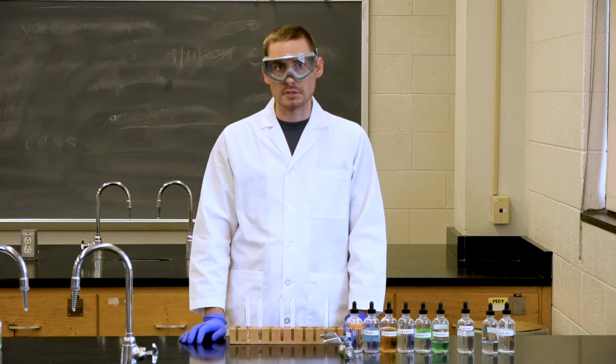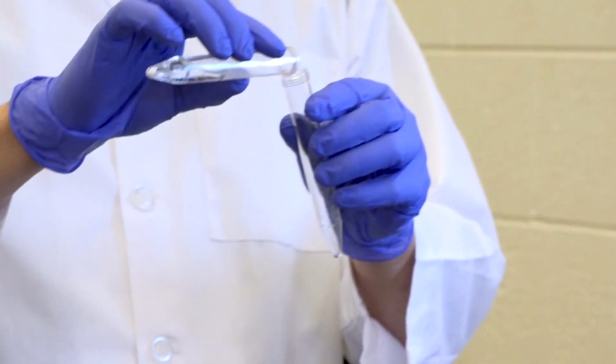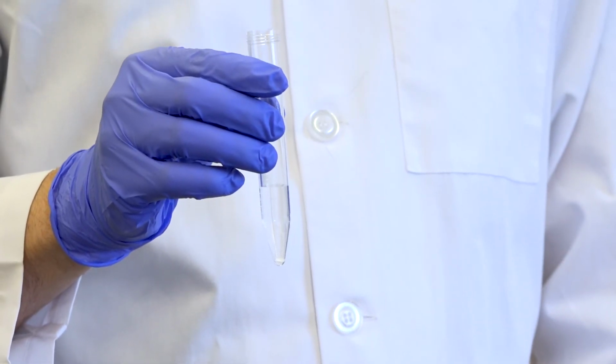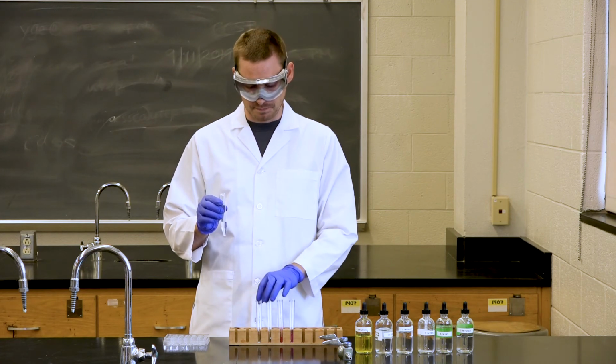Once we have removed the solution from the hot water bath, we can then pour off the liquid into a new test tube. This will keep the solid in this test tube, which we know is silver chloride. So once we've removed this from the centrifuge, we can now decant or pour off the liquid from the solid precipitate that is then centrifuged to the bottom.